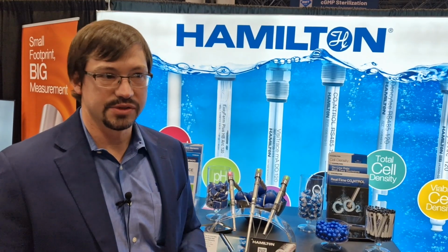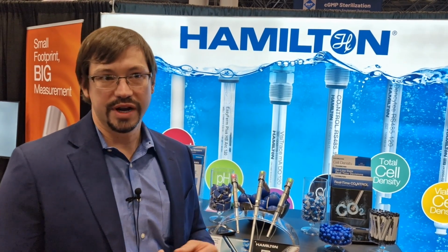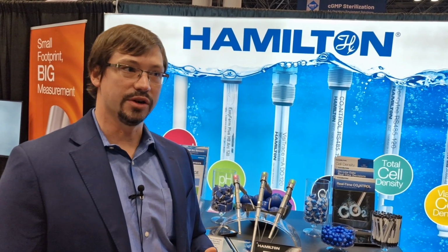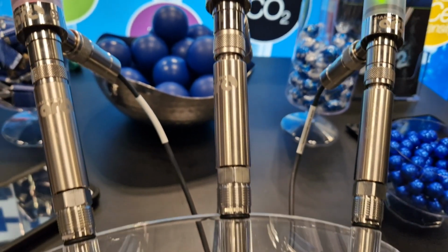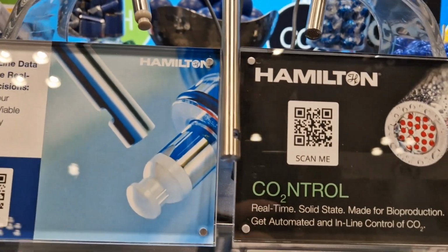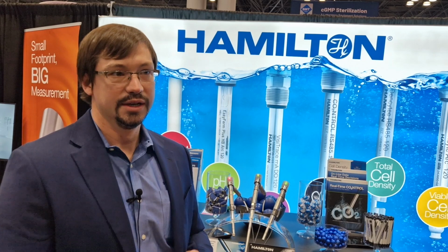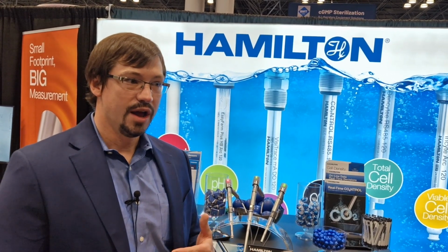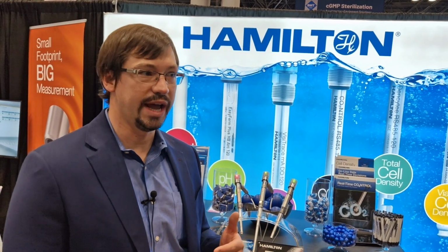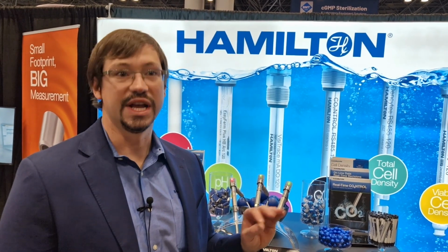In the mammalian space or the animal cell culture space, cells operate very much within a defined CO2 range under normal metabolic conditions. Too high a CO2 concentration, and you essentially are either stunting the metabolic growth, potentially altering pH. In both cases, those things result in reduced growth attributes, which can translate to reduced product quality as well as product quantity. So CO2 is a measurement that is often understood and controlled to some specification, but not necessarily controlled at the bioreactor or production scale within defined sort of deadbands.